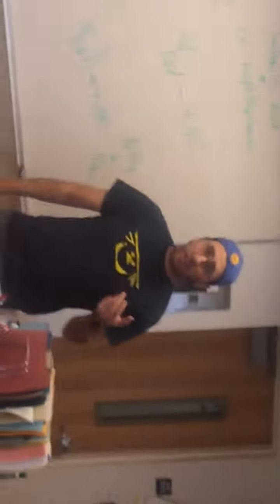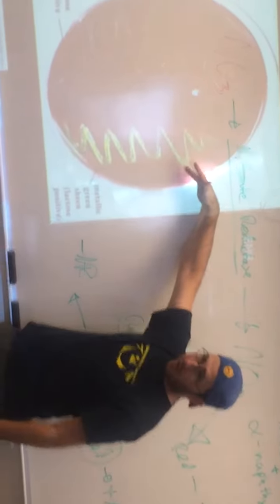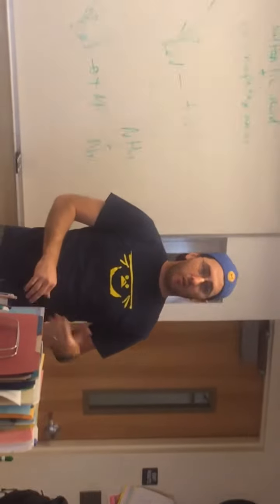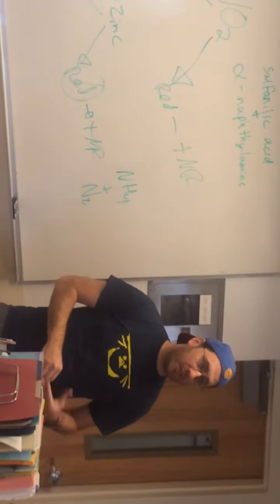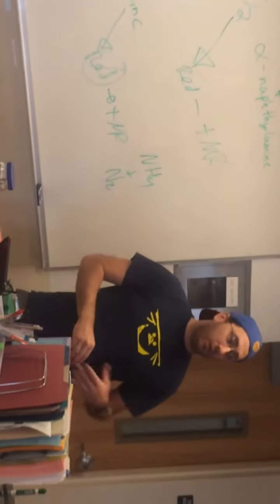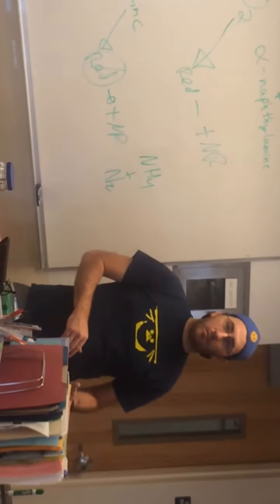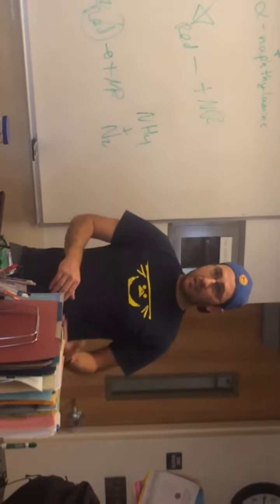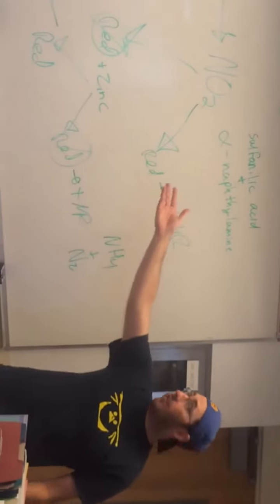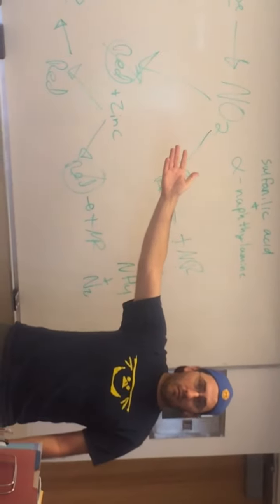Okay. So what you'll see is in PowerPoint form, you'll see this picture with an arrow pointed here. And the question will be, this test is positive for what? A, fecal coliform. B, gram-negative. C, gram-positive. D, nitrate reduction. E, A and B. F, D and C. G, all of the above. That's a question. You have 90 seconds to answer that.